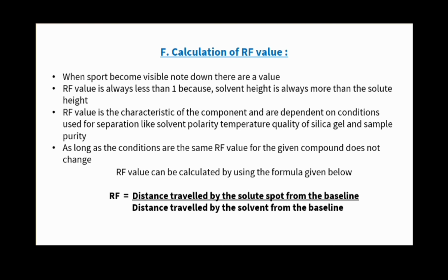After identification of the sample, we calculate the RF value by using the formula given here, and in this way we get separated components.